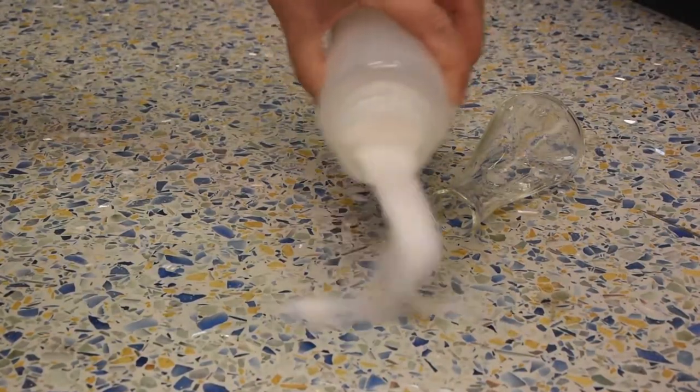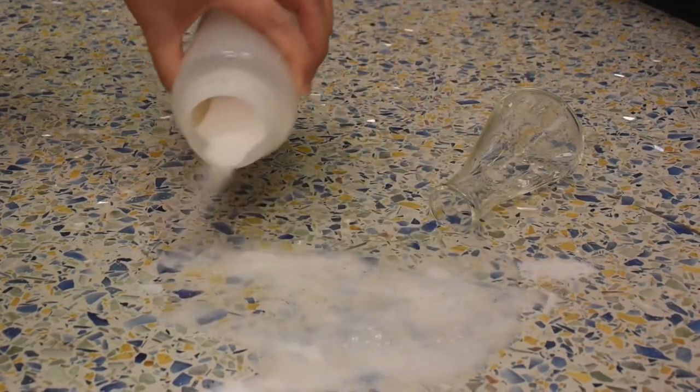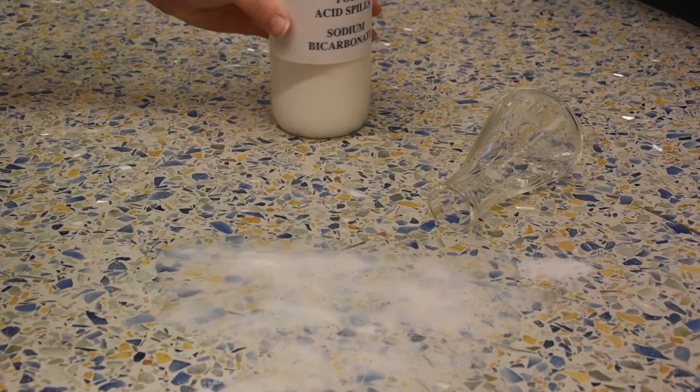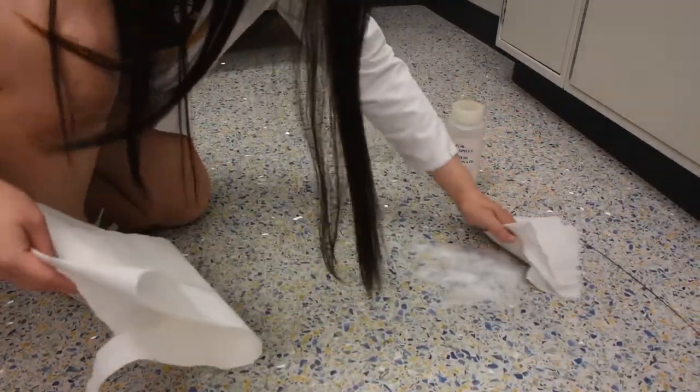Pour a generous amount of sodium bicarbonate all over the acid or base to completely neutralize the material. The reaction is neutral once the reaction has stopped bubbling. Clean up the spill with water and paper towels.